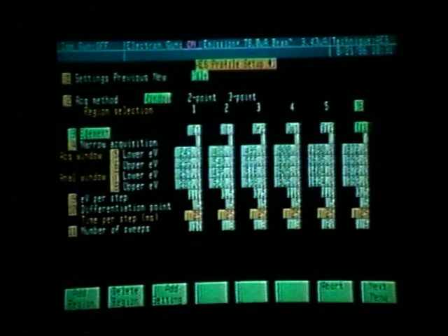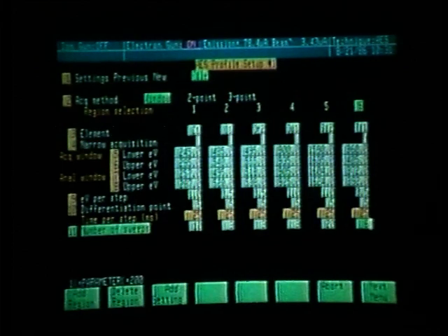Once again, let's not use narrow acquisition, but wide acquisition, so we will say no to narrow acquisition. Since that is a small peak, let's also go 10 sweeps. Function key 11, and number of sweeps 10.